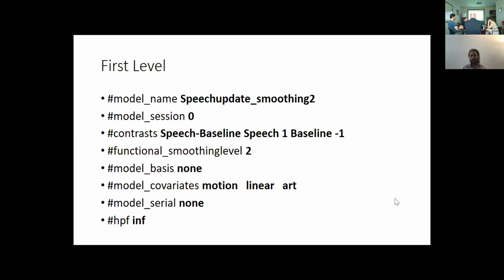Do you have any particular questions, any of you, about all of these configuration files or something that wasn't very clear at the time when we went over this? Since I'm using the older preprocessing one, do I need to rerun it, or is that more just a labeling thing? No, it's just the labeling. I don't think anything else has changed. In the config file that I uploaded in the FL folders, I just added the labels as part of it, just so that we would have that. Since you are not using those labels anyway, you don't need to rerun it, you don't even need them. I just wanted to comment in case you see the actual preprocessing pipeline there and you see that it's a little bit different from the one that you use and you worry about why those differences are there. Okay, great.